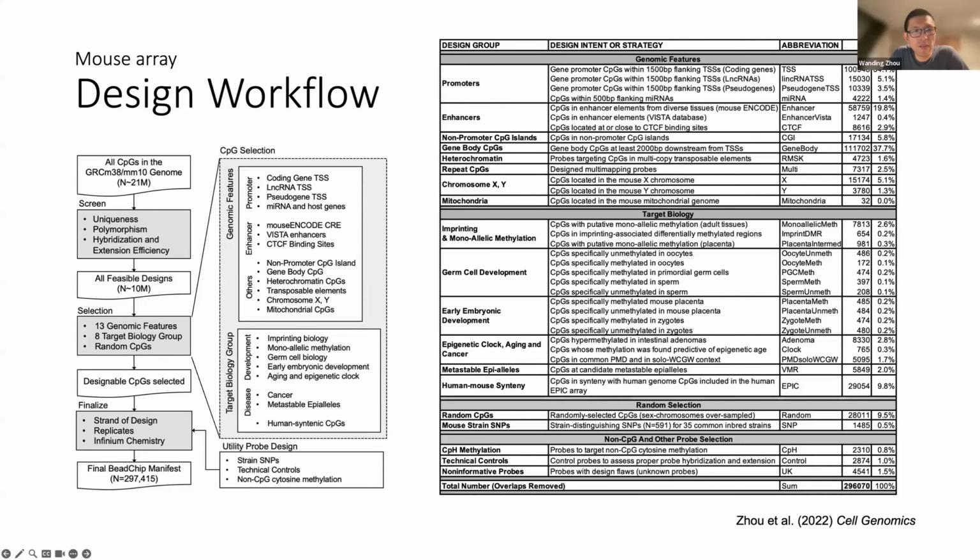Yeah, I think it certainly can. But there's also a cost consideration. That's more of an Illumina business decision, because to build an array there's an upfront cost, and I think it's very hard to build an array for a small group of investigators who are interested in one biology. That's actually also the case for the EPIC array. The beauty of this is that you can generate data for one biology, and if someday in the future you're interested in a different biology, you can reuse that data.